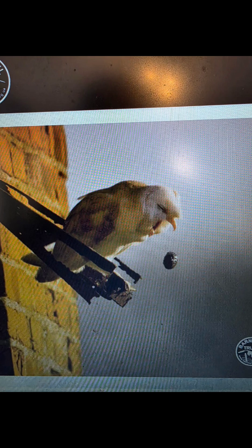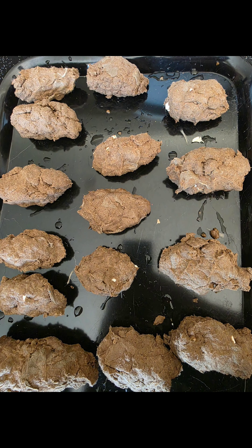Owls can swallow small mammals in one gulp. They can't always digest all the bones, so they cast them out in a pellet. If you dissect the pellet, you can find out all about the owl's last meal and wonder what it ate.